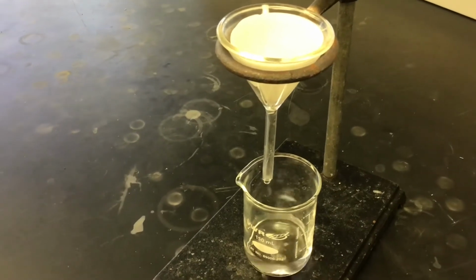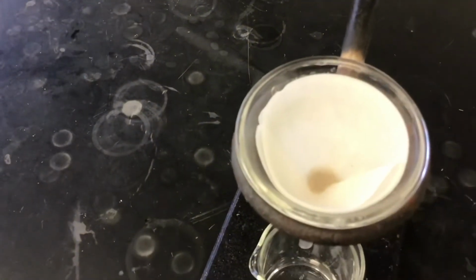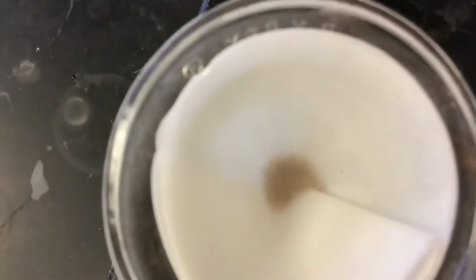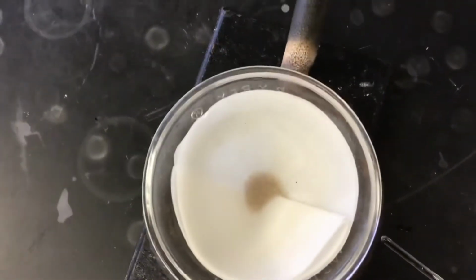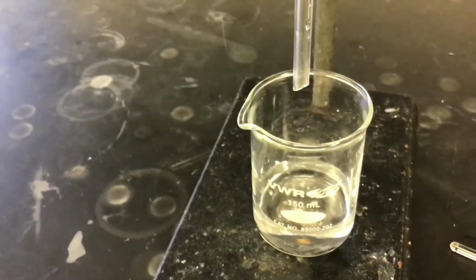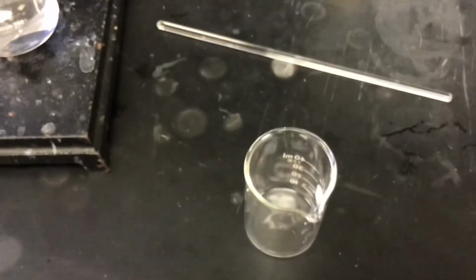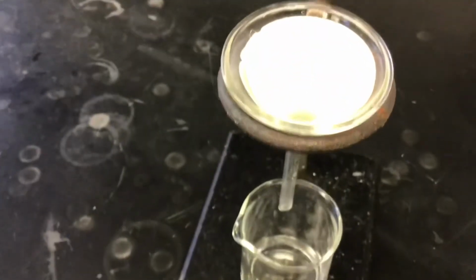Okay, so we're just watching it filter. So you'll notice that I just have that sand in the filter paper, alright? And all of it has come through the water, or salt water I should probably clarify. So I have the sand in the filter paper, and my original beaker, which is right here. My original beaker has no sand in it. So I have my salt water and I have my sand.